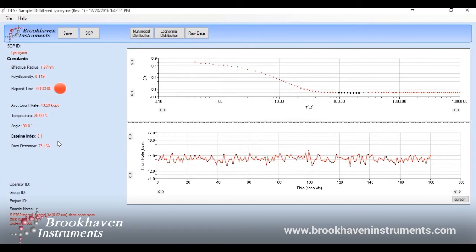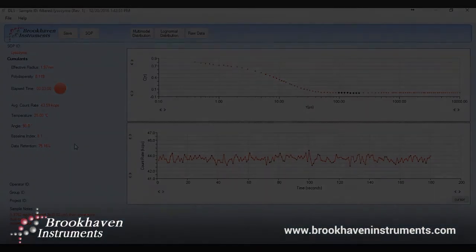This is evidence that the sample is clean and only a few dust particles were left to be taken care of by the digital dust filter.